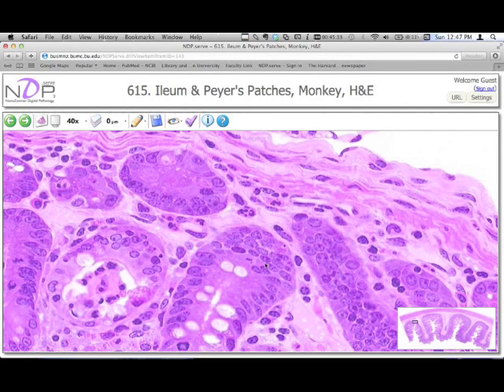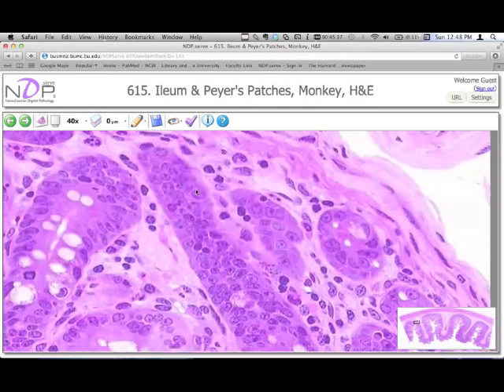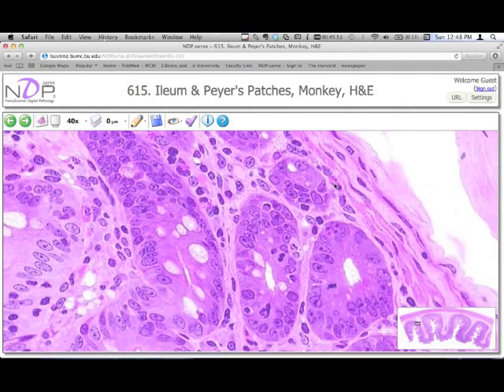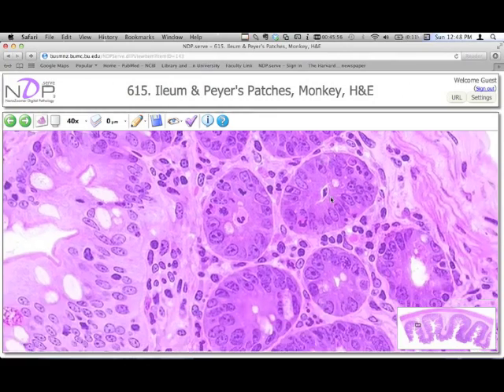Now an eosinophil is very, very similar to this. It has a lobed nucleus, anywhere from 2 to 3 lobes, but it also has the pink eosinophilic granules. So we'll see what we can do here, and there's probably one here. So there's a lobe, and maybe even this is a lobe. And here's that eosinophilia, which is characteristic of the granules that we have seen earlier. Okay, we'll keep looking around a bit and see what we can see.